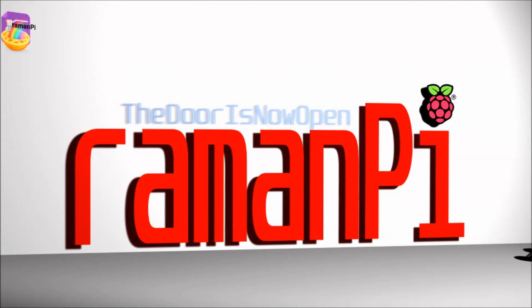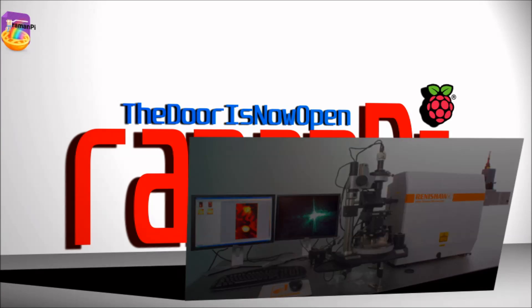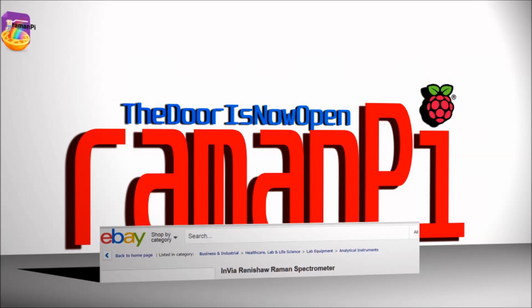ramanPi started as a project that filled the need for another project I'm still working on. I had to obtain the bond angle and Raman shifts for samples that I was producing. That called for a Raman spectrometer, and access to one is financially prohibitive, as even used units run tens of thousands of dollars. I set out to build a Raman spectrometer with no knowledge on the subject whatsoever.